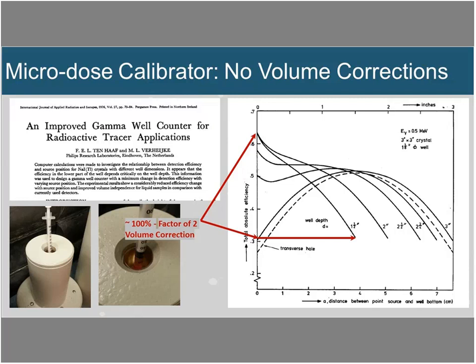So he has to make 3 samples because these measurements are very inaccurate, and again, his calibration sample was good to maybe 30–40% accuracy. This really shows you how someone can be open to making mismeasurements. But if you don't have an instrument that can actually show you what the error is, you're completely blind. It's very hard to actually see it. So that was some of the experiences that I had.